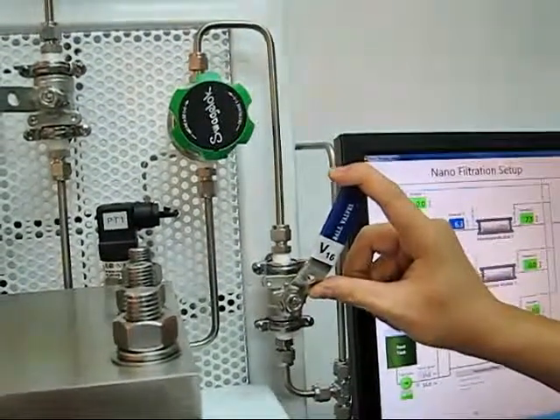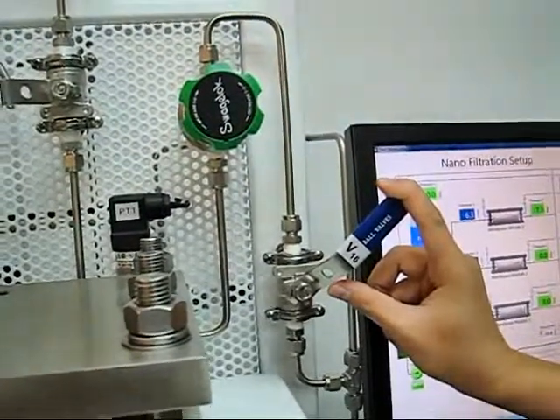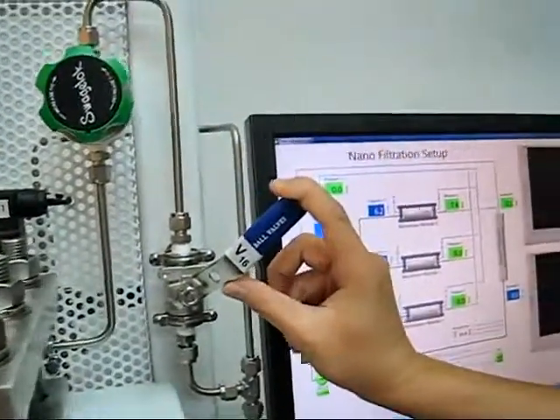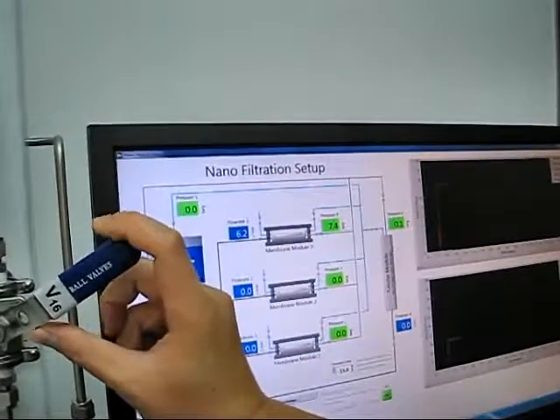The valve is now very, very slowly being closed. You can observe that the pressure value is changing right now — 7.2, 7.4.